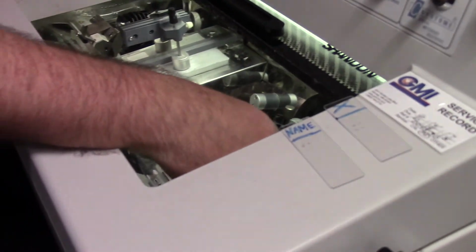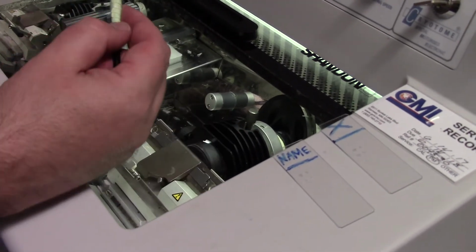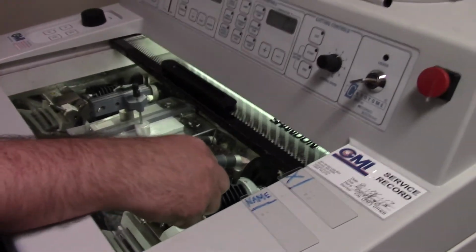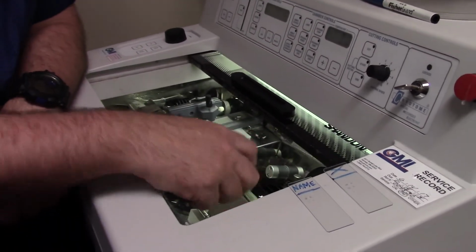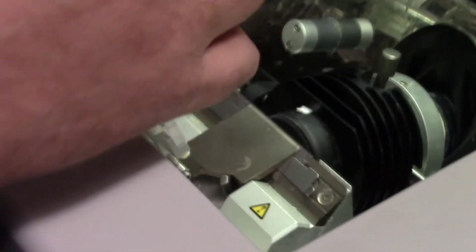Notice that I'm always brushing away from the blade. If I was to brush back towards the blade, all of the hairs would be cut off in one try. So always brush away from yourself. Remember, that is an unreasonably sharp knife. It has to cut 20 microns thick. Of course it's super sharp.